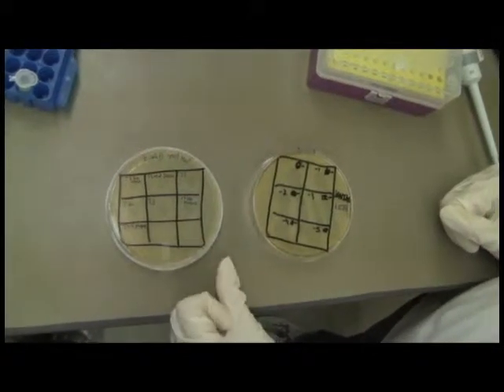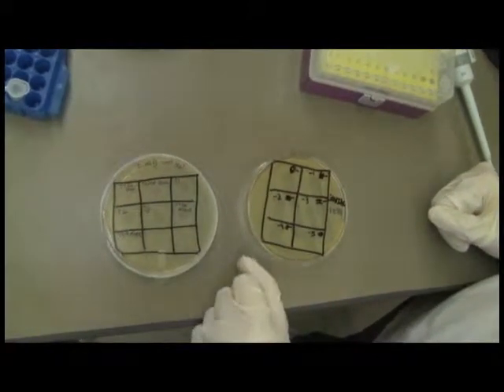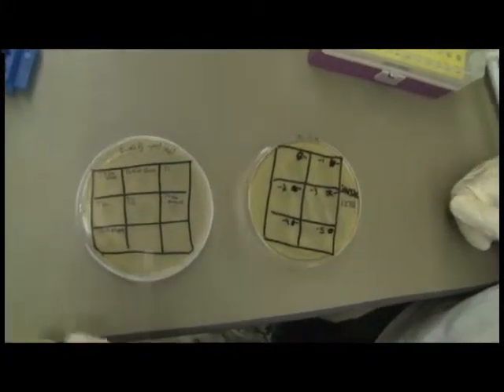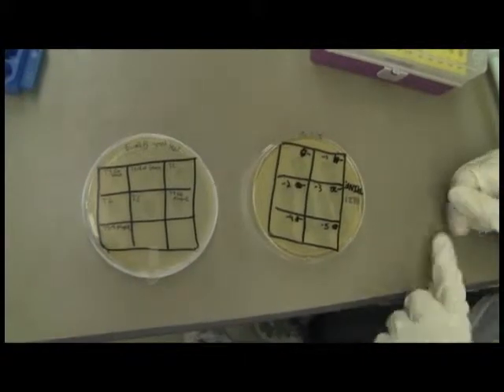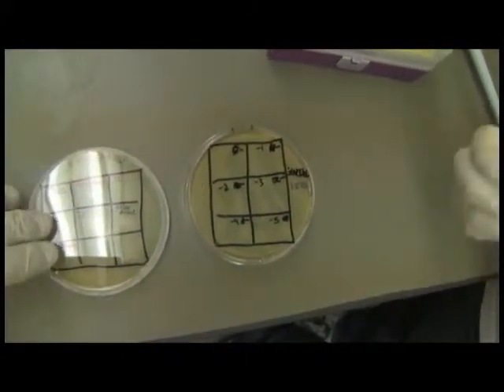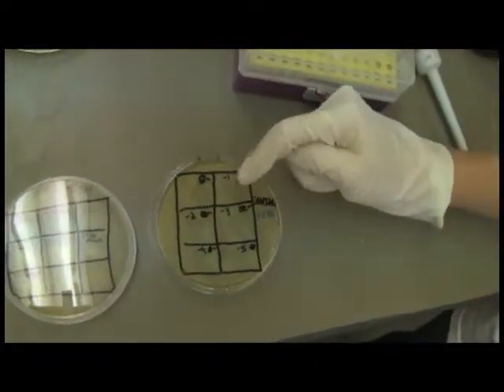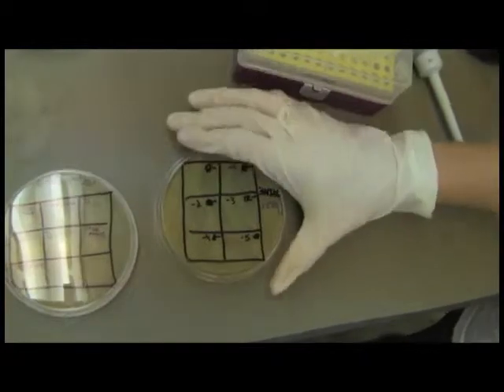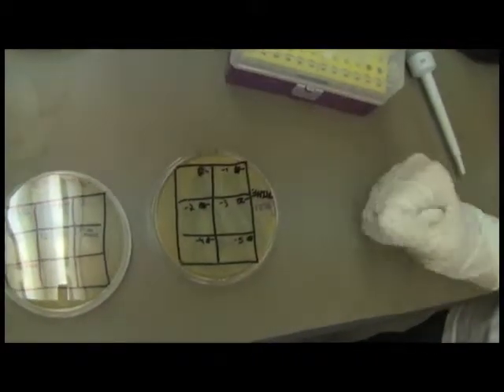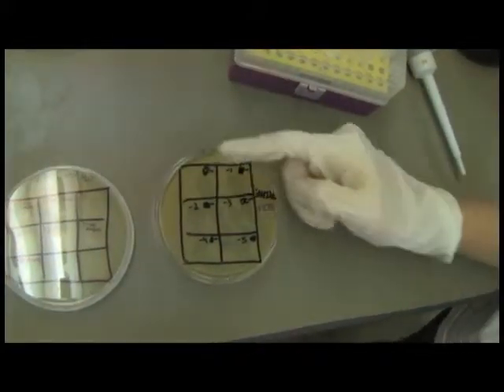This is an example of a good spot test. Each one of our samples did actually have phage in it, so you can see the plaques that they formed. In these two, we don't have anything, so no phage. Over here we have a plate that we tipped over too soon. So the spots didn't sink into the agar, and so when it got tipped over, they all ran. So not quite as pretty, but there is phage in there, since there's lysis.